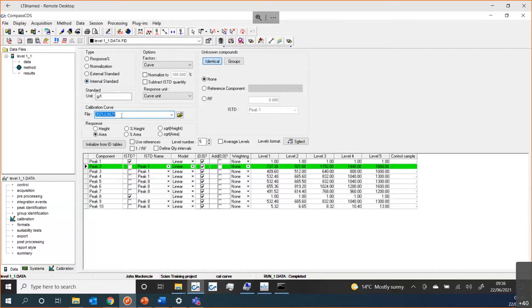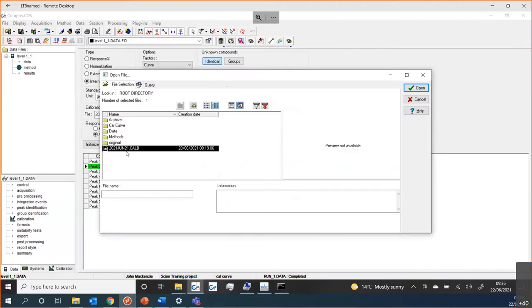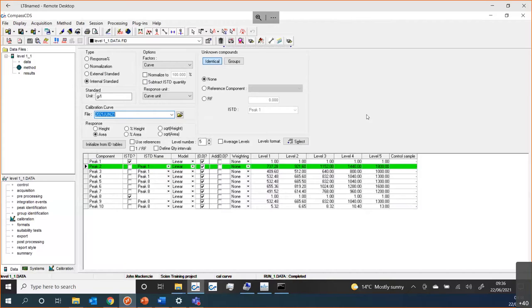Each calibration curve that you create exists as a separate file. We include it inside the method and inside the data file, but it is a standalone file that you can associate with other methods or other data files. To choose another calibration curve, you can just press open and select which one you would like to use. It allows you the ability to create a calibration curve with one set of data files and then use that calibration curve in a different method or a different set of files — a very useful feature.